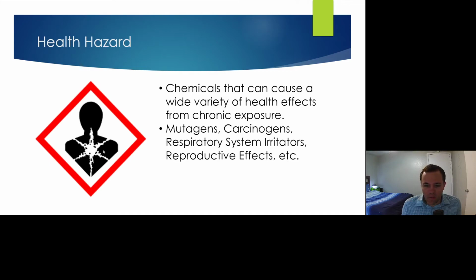All right, this one where it's got the little symbol underneath this person's chest is the health hazard symbol. This is ones that aren't going to cause immediate death or sickness to you if you get exposed to it one time. But over the course of, if you work with it for a long time and have chronic exposure, which means over and over again every day, even in little tiny quantities, they can build up in you and cause all kinds of problems, from causing mutations to causing cancer.